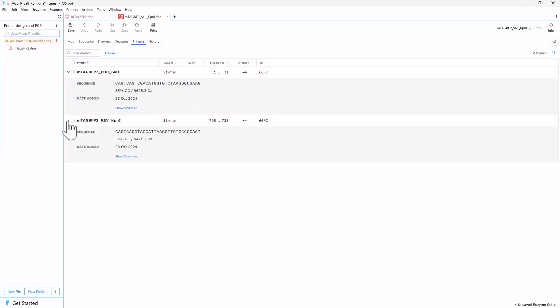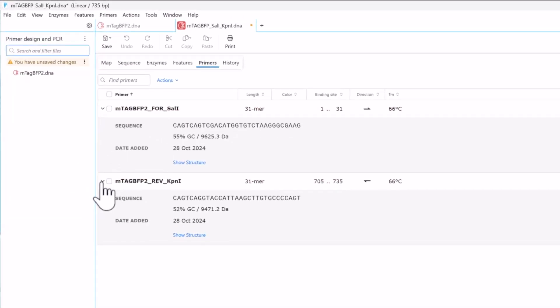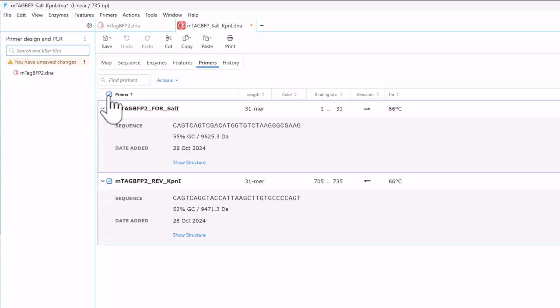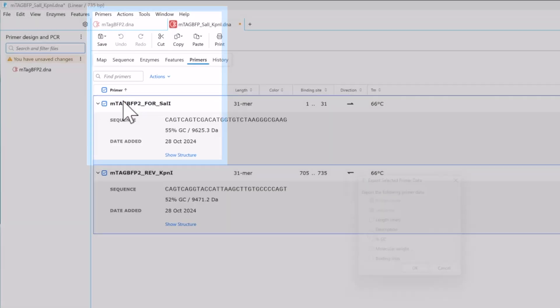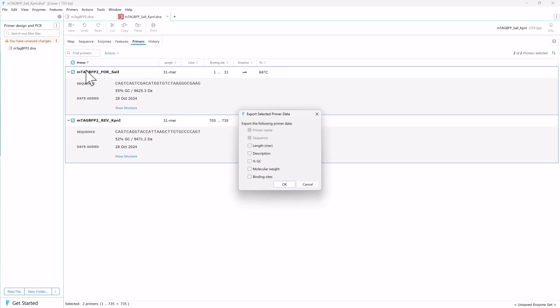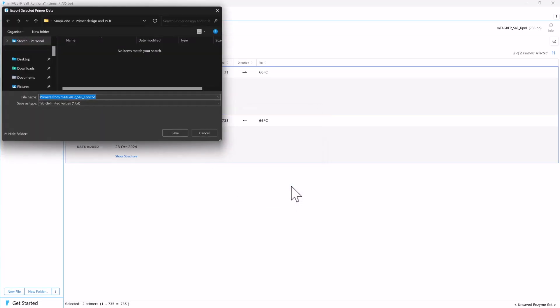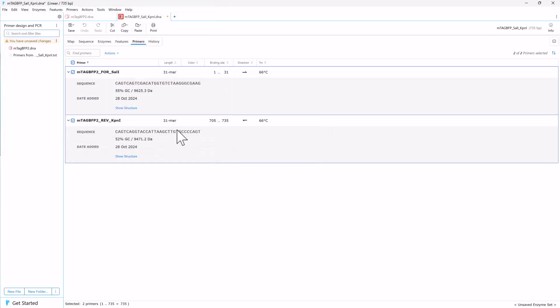To export your primer sequences for ordering, select and export them as a text file by going to Primers, Export Selected Primer Data. Export to your project folder, where you can copy and paste the text into an online primer order form.